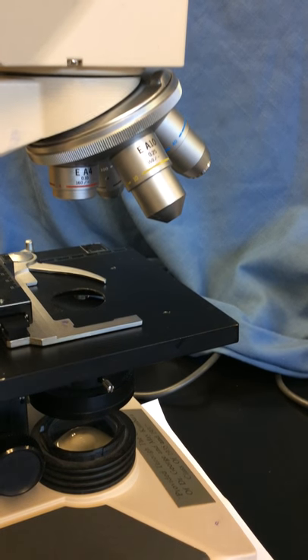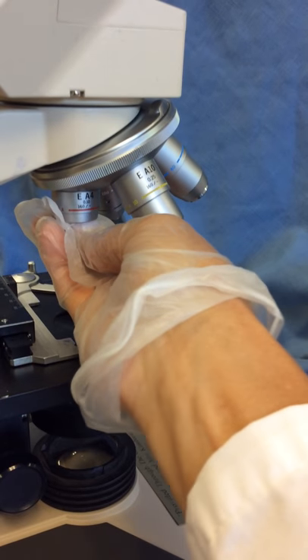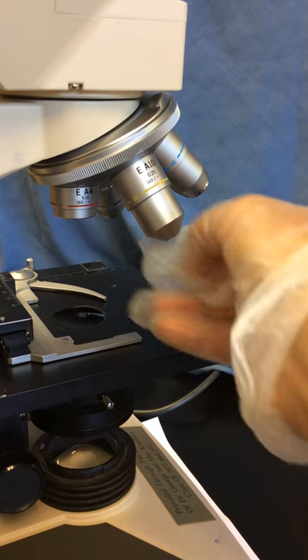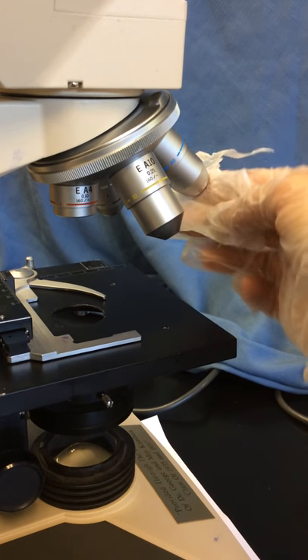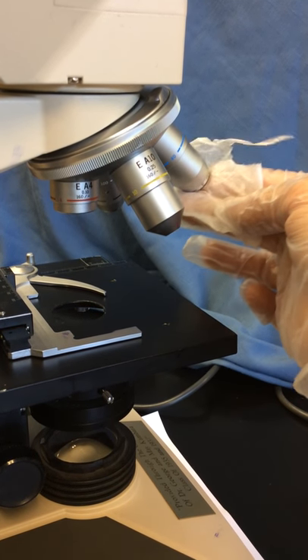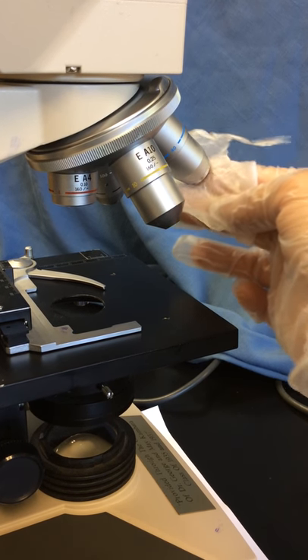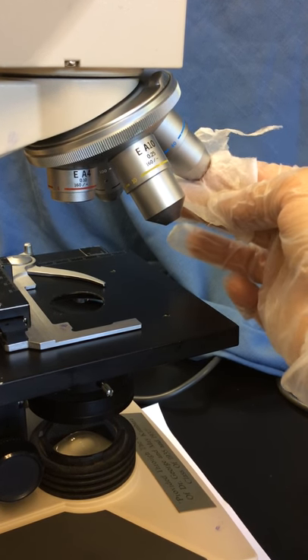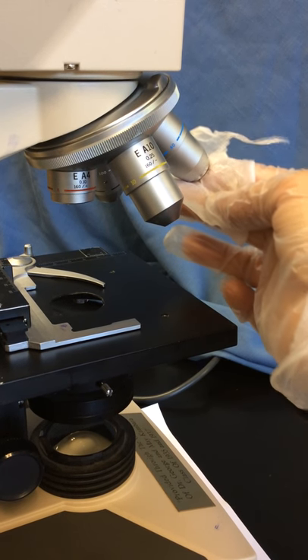I would start by cleaning the scanning lens and then move over to the low power lens. Very important to check the high dry lens because the high dry lens is so long, if there is immersion oil on a slide, by accident we might drag the high dry lens through the immersion oil and we'll get immersion oil on the high dry lens.